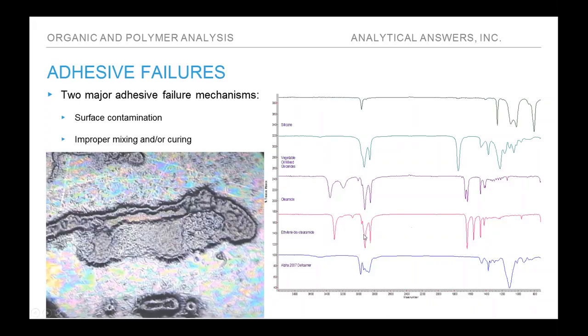These two we affectionately refer to as bag wax. These are slip agents that are found inside common plastic bags. They're also used a lot as lubricants and mold release and so on in polymer molding, extrusion molding, and so on. So this is why we recommend the samples not be placed in plastic bags when you send them to us. And then down here we have non-ionic surfactants as well as other things which show up in there.